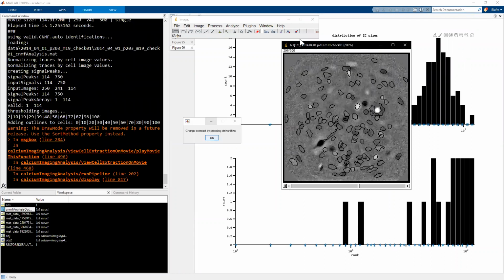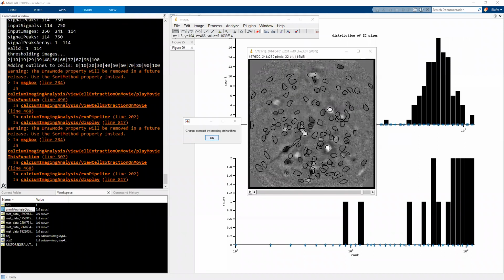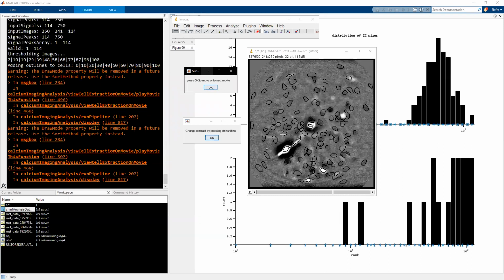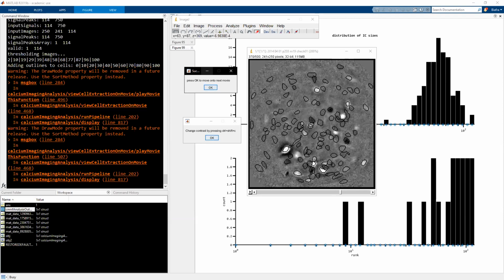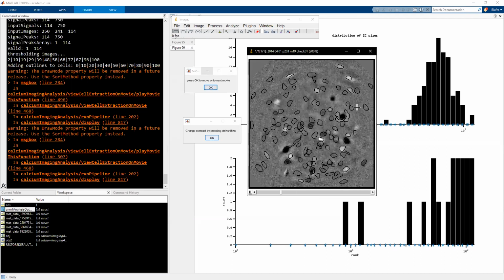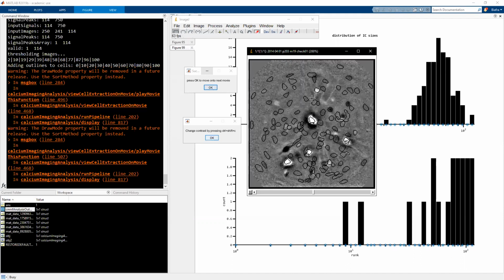And so you basically can see that here, where each of these individual outlines indicates where an individual cell was found, in this case in the CNMF algorithm. For example, if something was run non-optimally, you can go in and see, okay, if I'm missing cells here, maybe I just need to run it with slightly different parameters. This is a really quick way to check: are you finding all the cells in the movie, or are things potentially being missed based off of the default parameters?